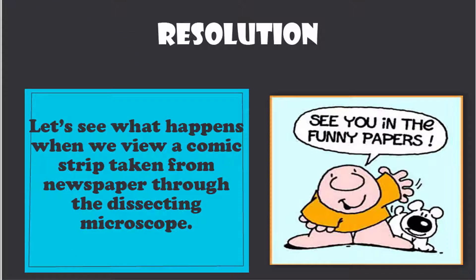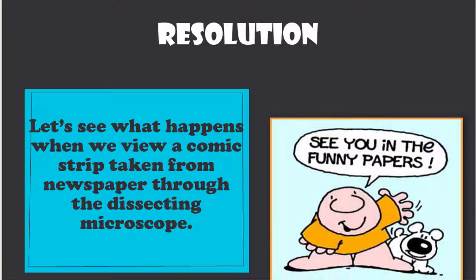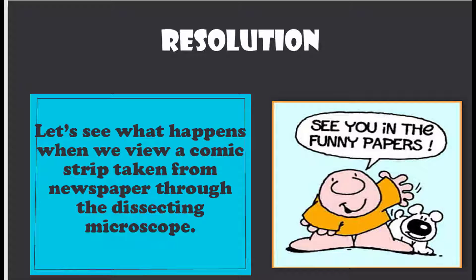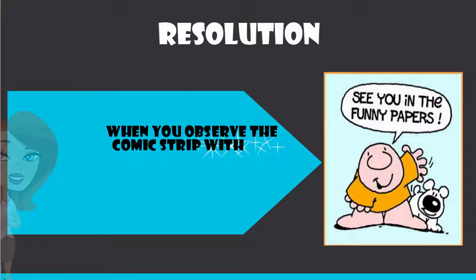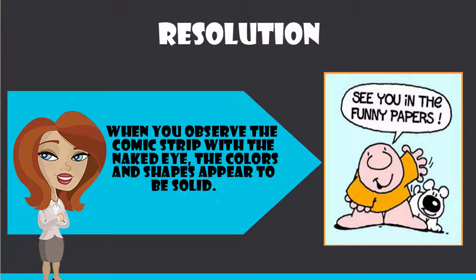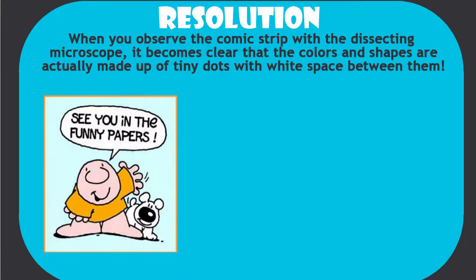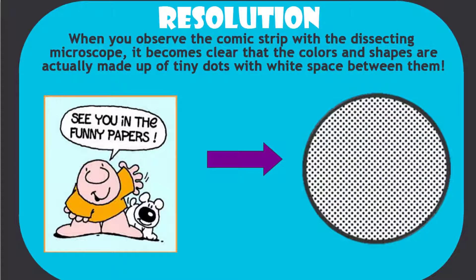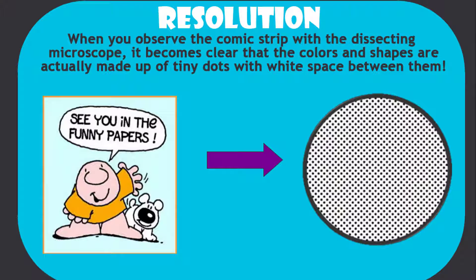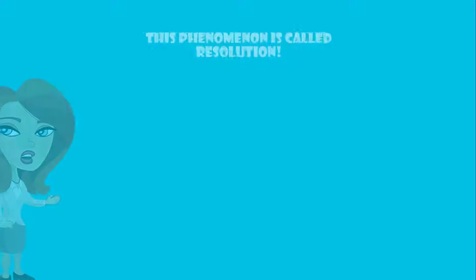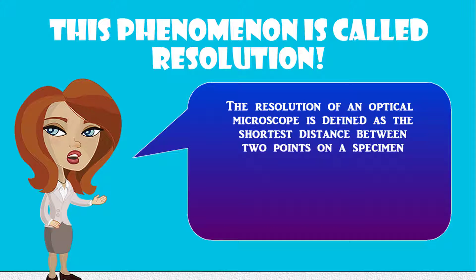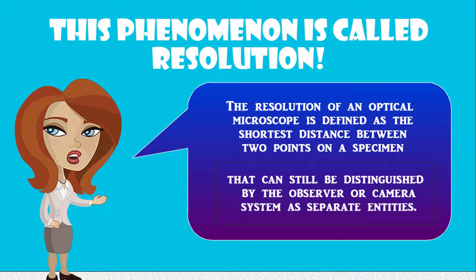Let's see what happens when we view a comic strip taken from a newspaper through the dissecting microscope. When you observe the comic strip with the naked eye, the colors and shapes appear to be solid. When you observe the comic strip with the dissecting microscope, it becomes clear that the colors and shapes are actually made up of tiny dots with white space between them. This phenomenon is called resolution. The resolution of an optical microscope is defined as the shortest distance between two points on a specimen that can still be distinguished by the observer or camera system as separate entities.